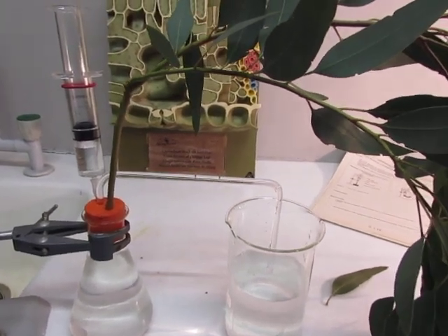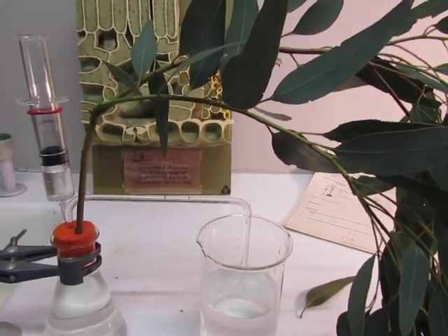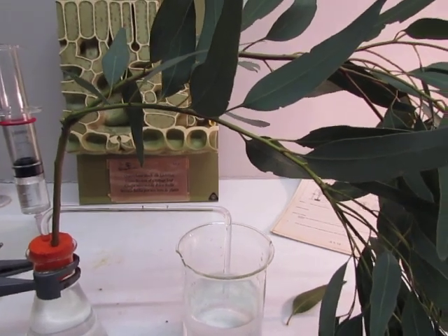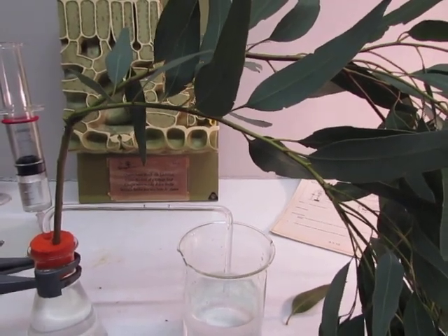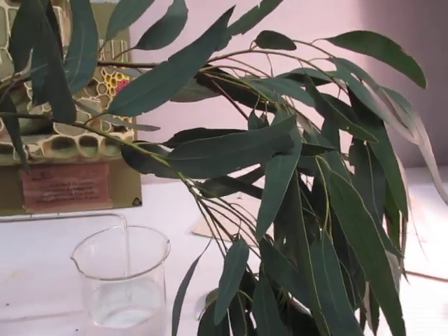So what I'm going to do is determine the influence of various environmental factors on the rate of transpiration. Factors like the effect of a very dry, hot wind, or an increase in humidity around the plant, or maybe even the influence of increased light intensity.